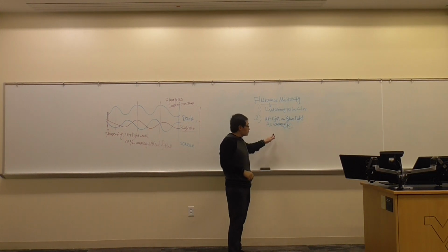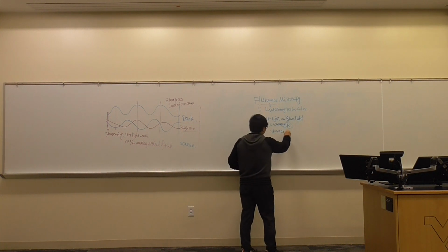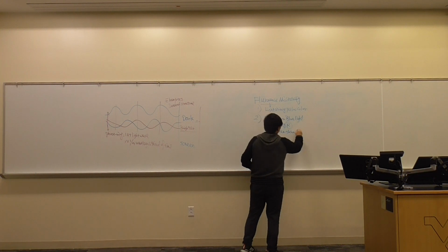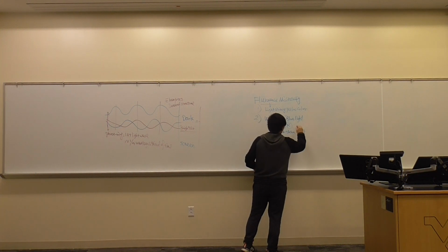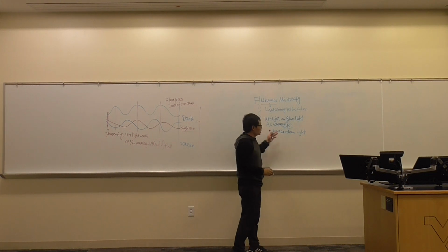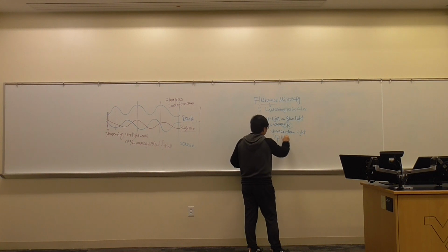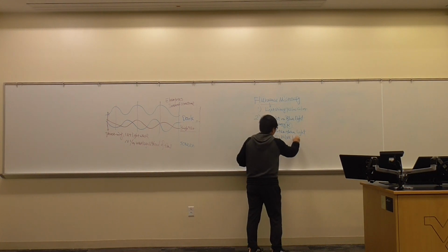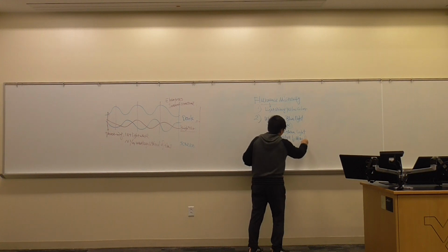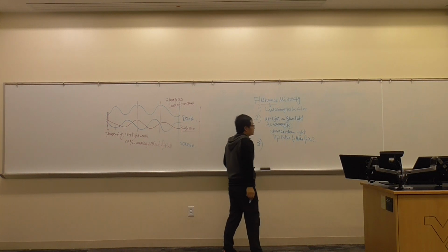Now, you know that the wavelengths of UV light and blue light are shorter than regular light, sunlight, let's say. They're shorter than that. So this is going to be more focused, because the resolution power value will be decreased. It will be more focused. The resolution power will be increased. So this is the second thing I want to mention.